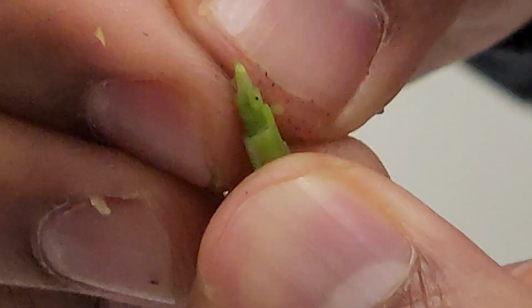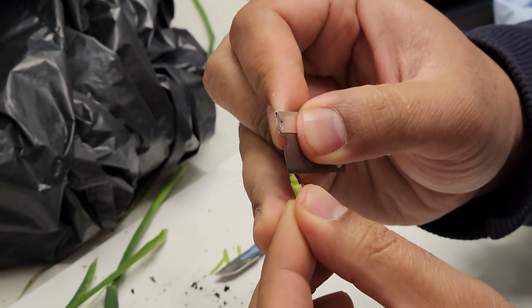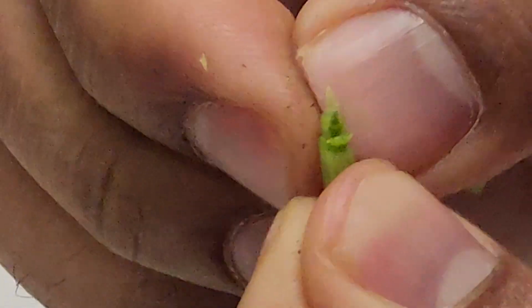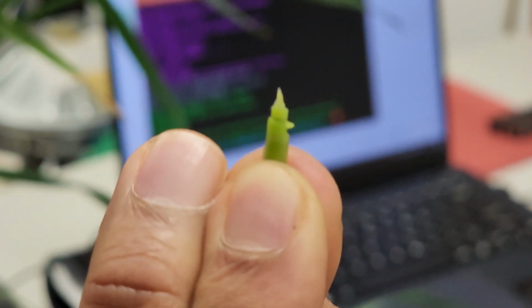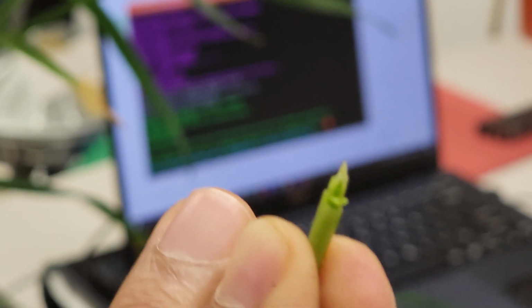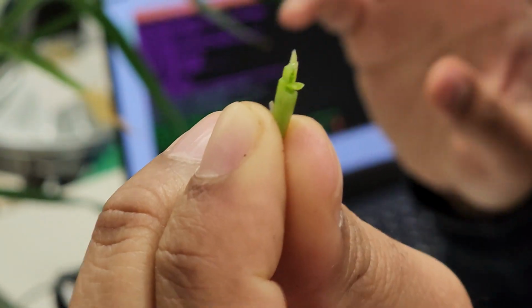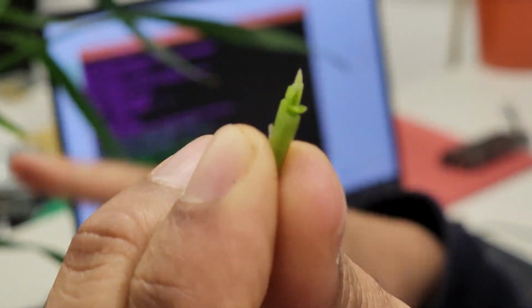Oh no! Oh, meristem again. See? I think that's a meristem. Get it? Ah, yes. Right, right. So we have sacrificed 3 tillers. So it's confirmed now. The location of the meristem is there.